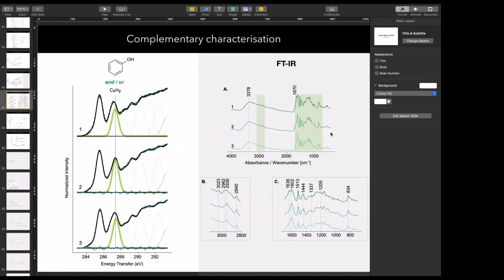The question is how many carbon scatterers can you access with your X-ray beam? You can have 90% carbon and 10% lead, and you see nothing. You can have 90% hydrogen and 10% carbon, and you see a perfect carbon signal. So that's the bottom line. The bottom line is not so much the concentration; it's really how many of the carbon atoms you can reach with your X-ray beam. Thank you.